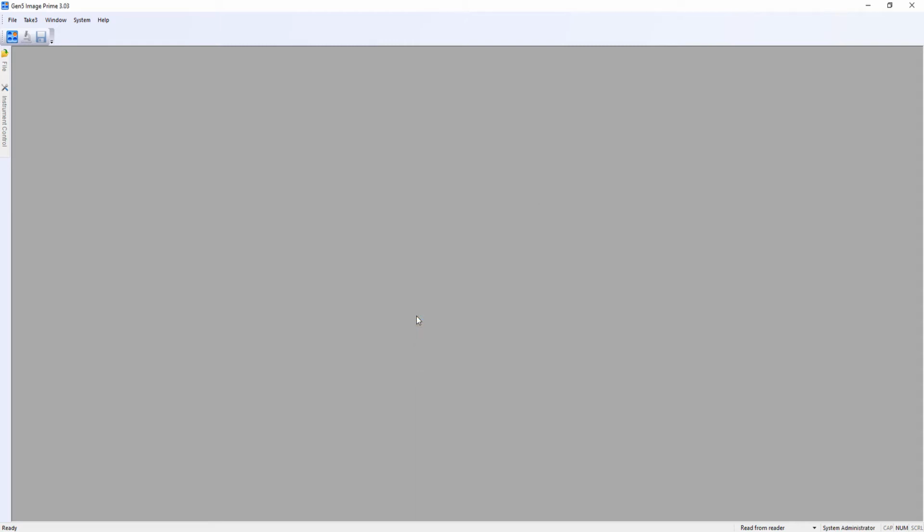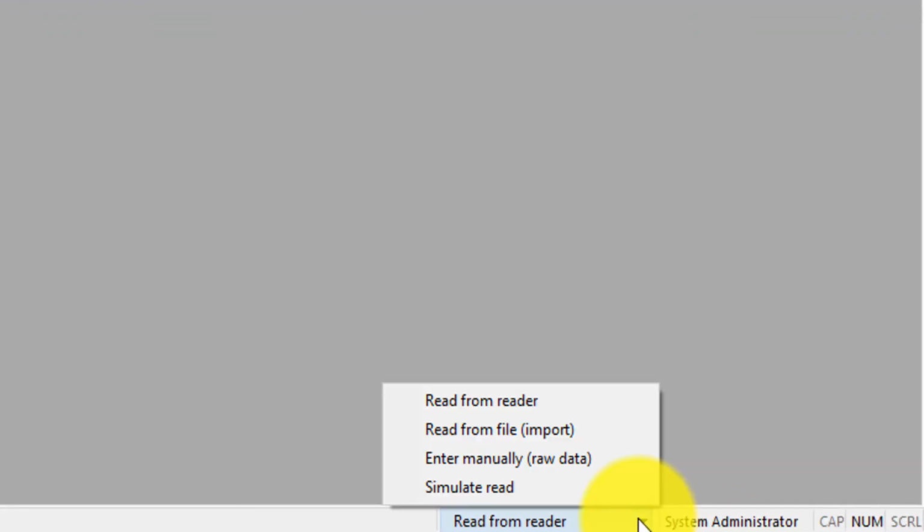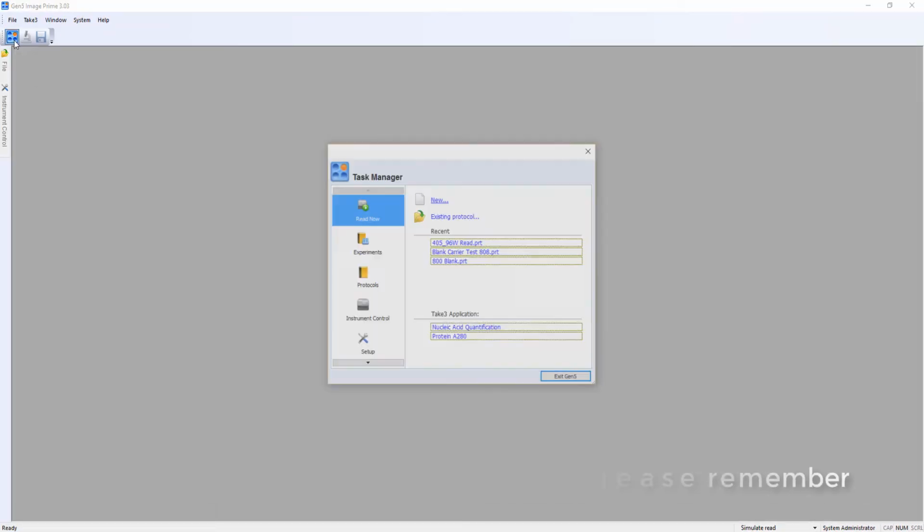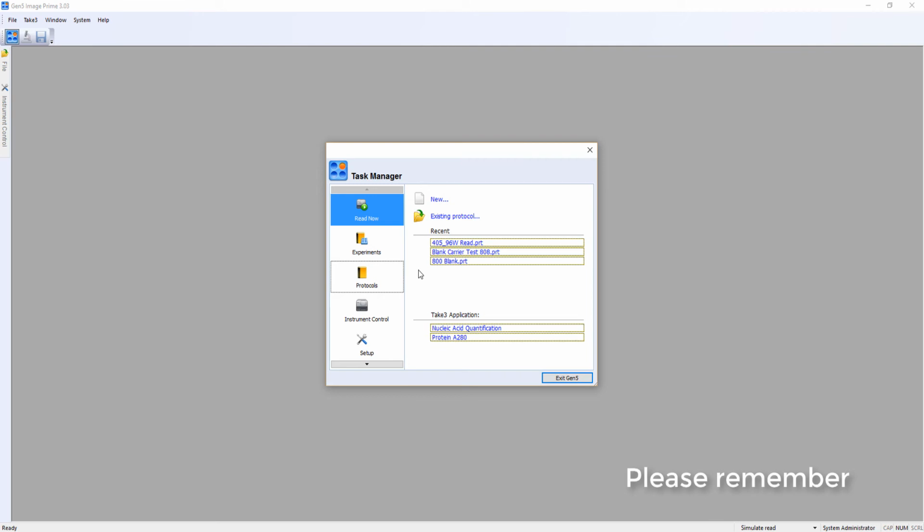Select OK. Once logged in, in this bottom right-hand corner, we'll click the downward arrow, select Simulate Read, and then scroll back to the top, select the blue microplate icon, and we can now proceed to setting up our read.